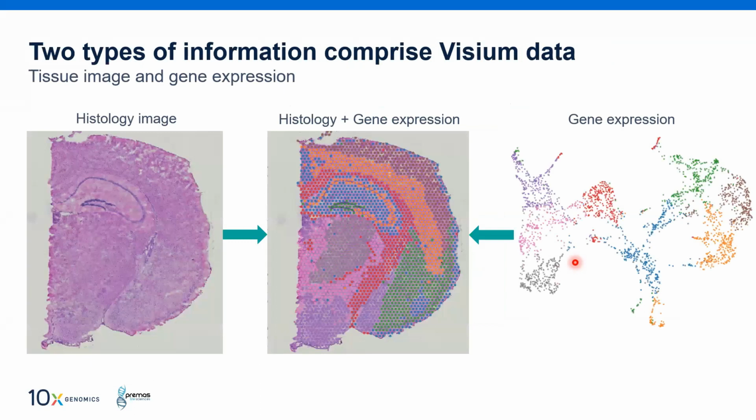So another technology, again from 10x Genomics, is helping to map the data to the location on the tissue at 1 to 10 cell resolution right now, and in the next year you will get single cell resolution. So here, if you see, this is a histology image. Many people are aware of sectioning the tissue, placing it on the slide, doing imaging or H&E staining, and then taking the image, and then morphologically finding out what cell types, which tissue type, where exactly the variation is.